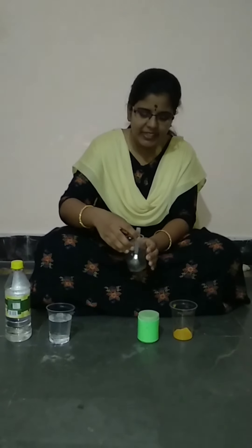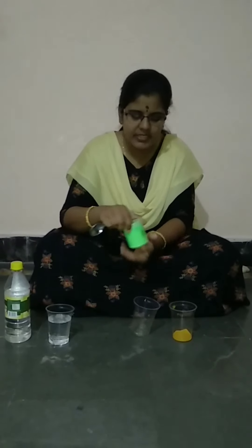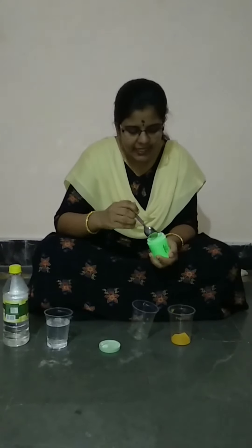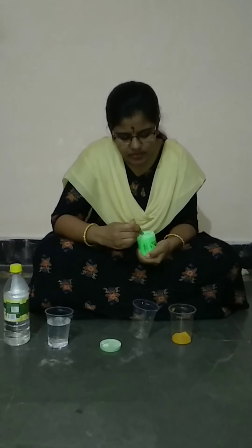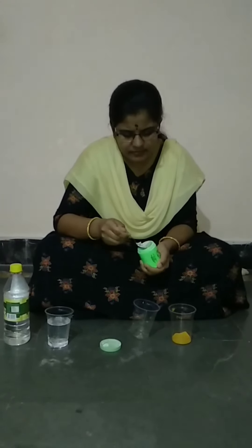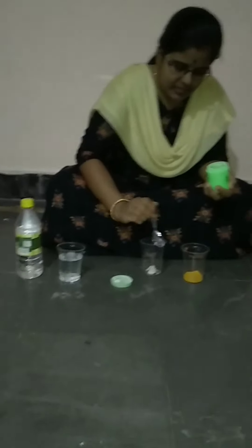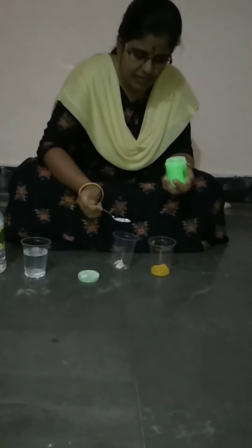First, let me take the empty glass and let me add some of the calcium hydroxide. So here I am adding some amount of the calcium hydroxide.